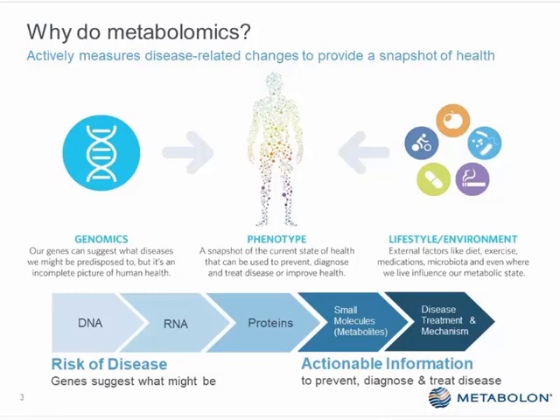And that's certainly been the case. We've found a tremendous number of applications, and that's the first thing I'm going to talk about. The surprising discoveries we've made are just how applicable this technology is for a lot of different areas. And of course, we also get a lot of information about the environment, xenobiotics, drug metabolites, and things like that from how we run our technology. So when you combine these different types of information, whether you're looking at a cell, a blood sample, or a tissue sample, you're really getting a good overview of what's happening metabolically and phenotypically in that organism or in that cell.